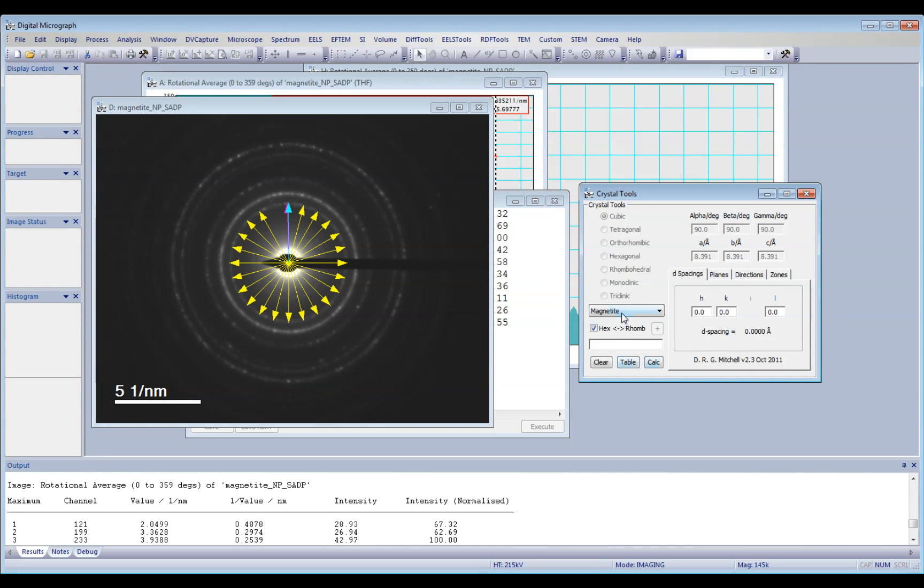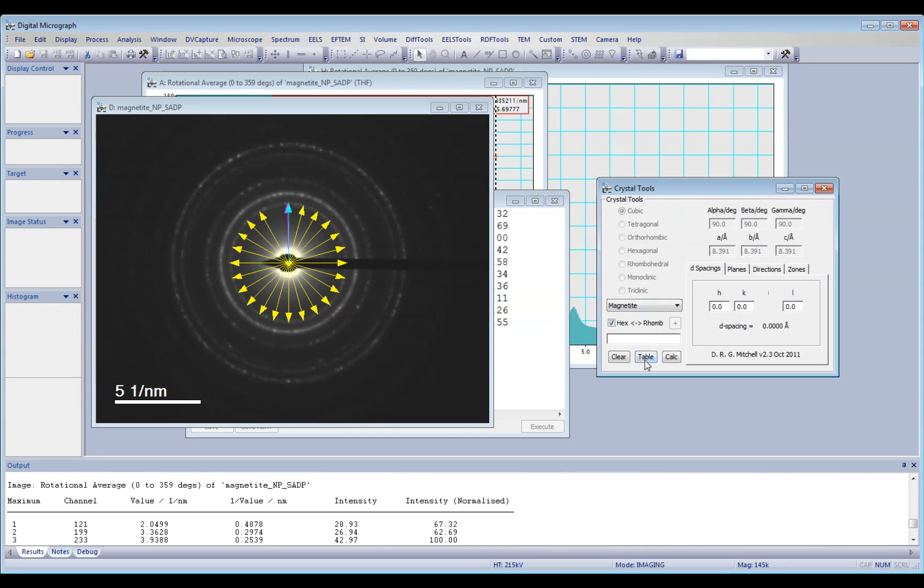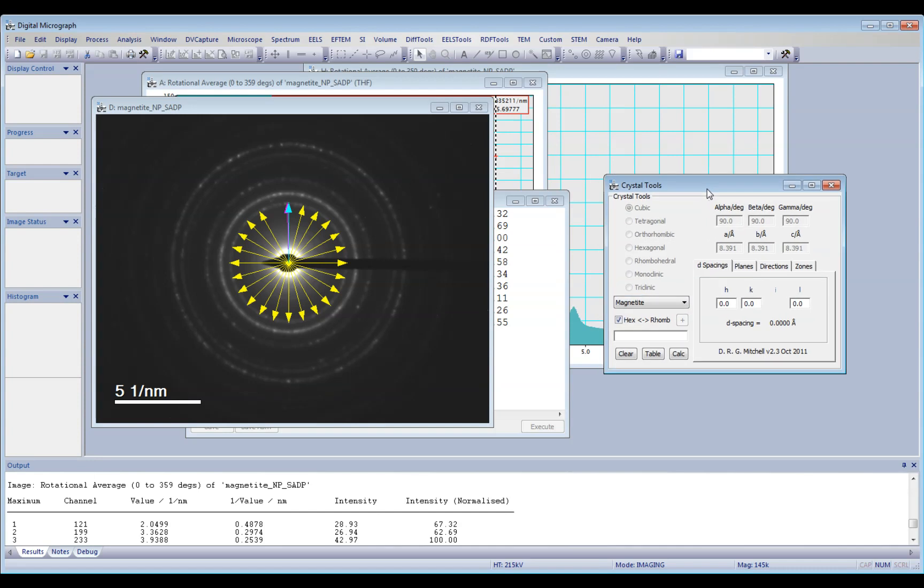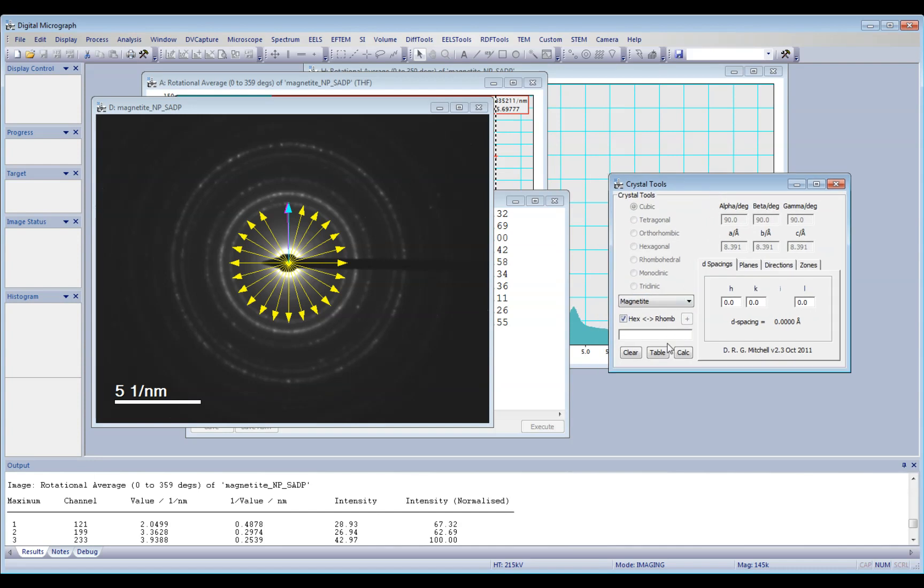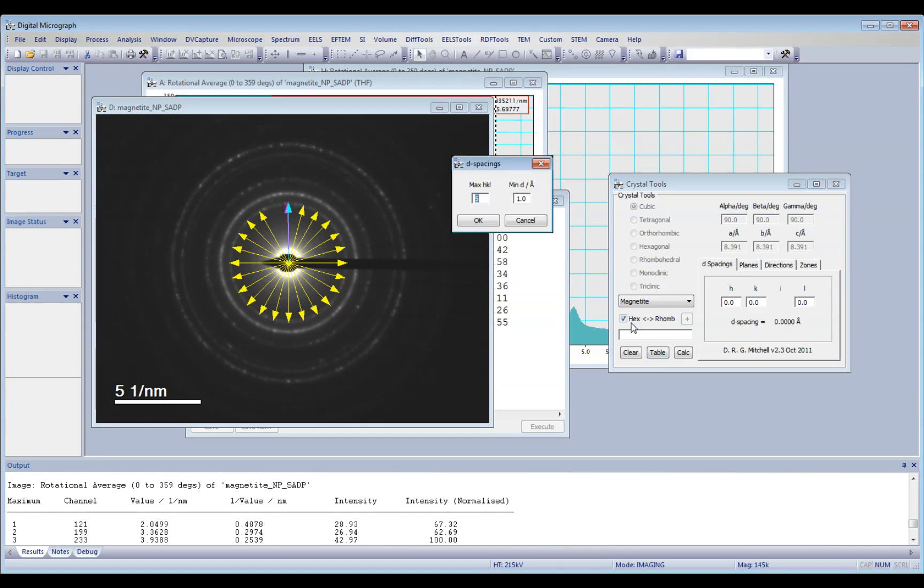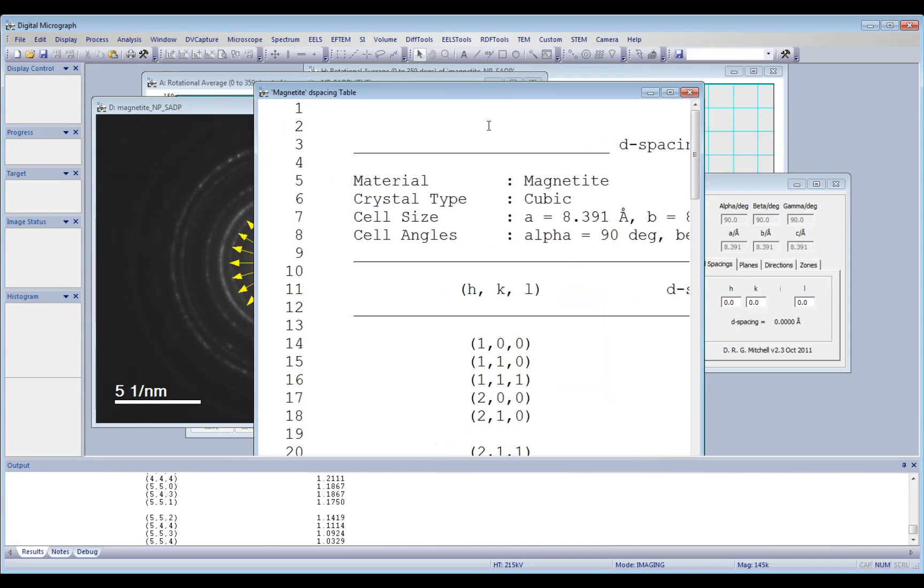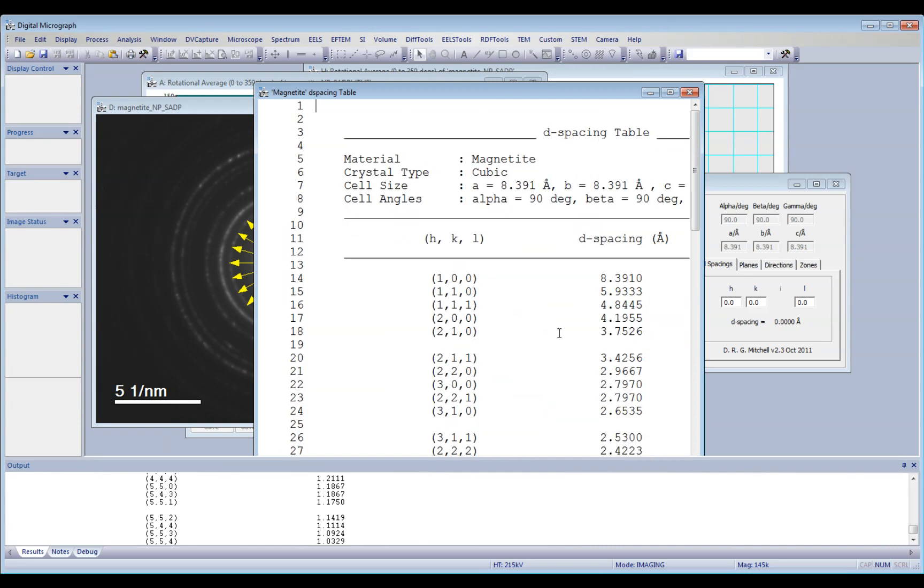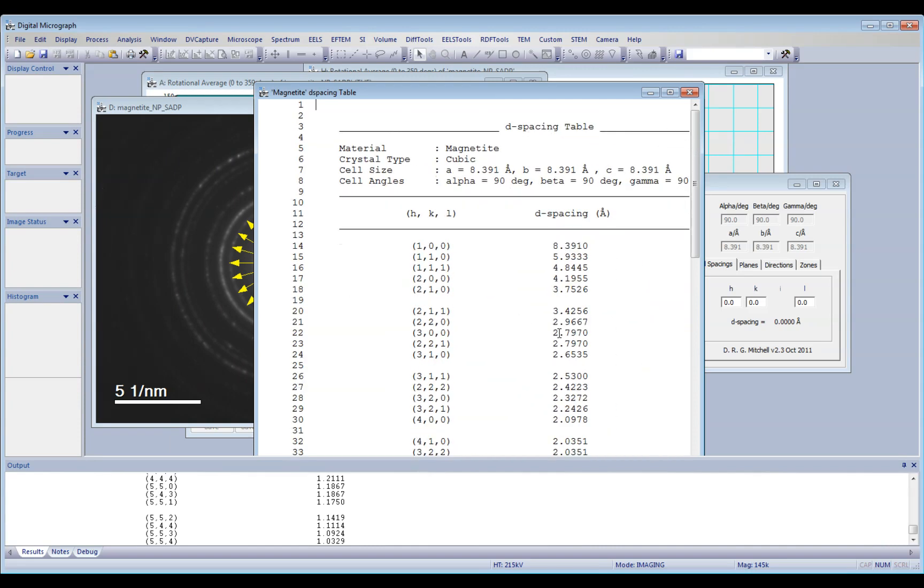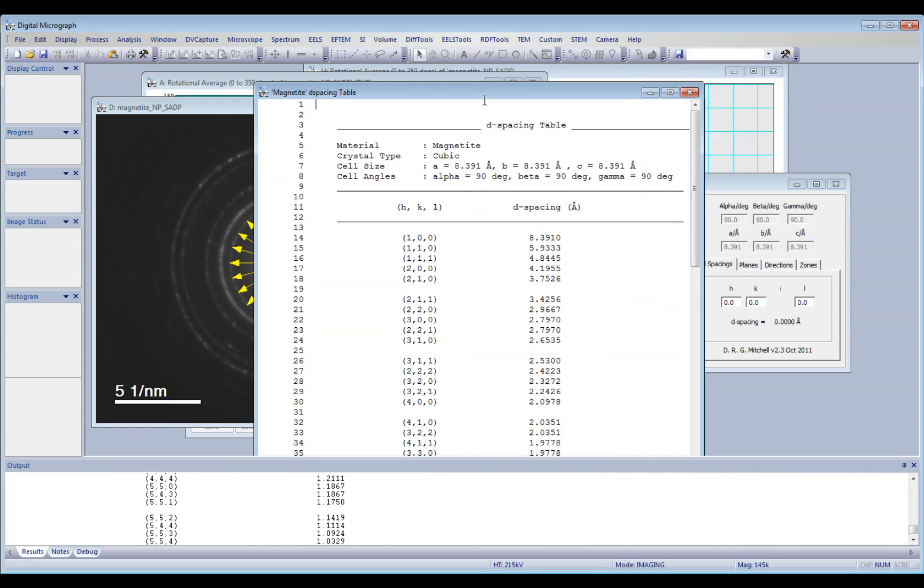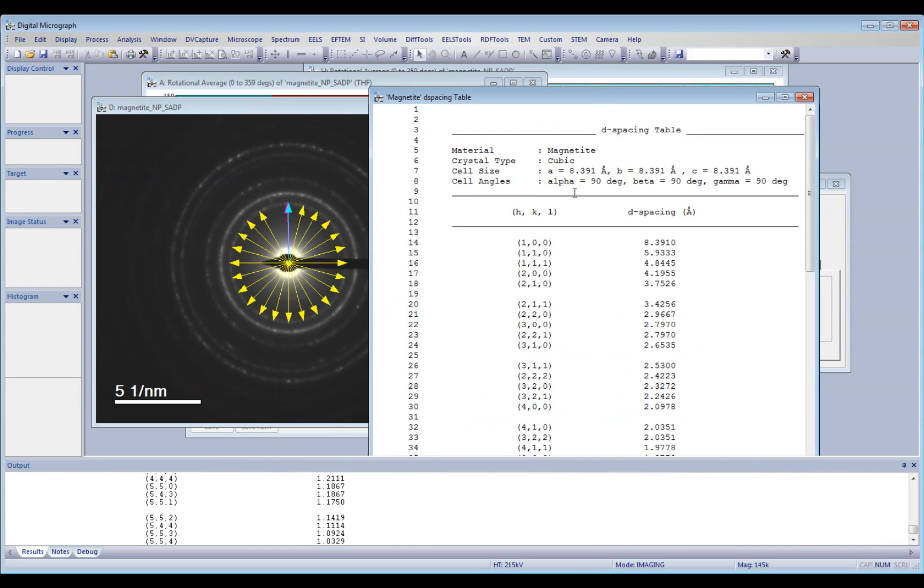Once you have selected the standard material, your reference material, you click on table here, and click OK, so it will give you the list of the HKL reflections, and the corresponding D space in angstroms.